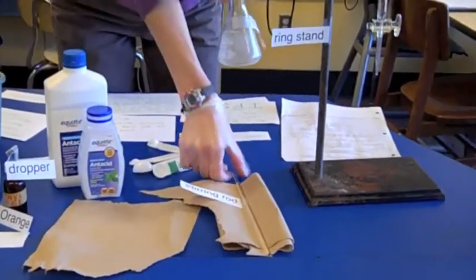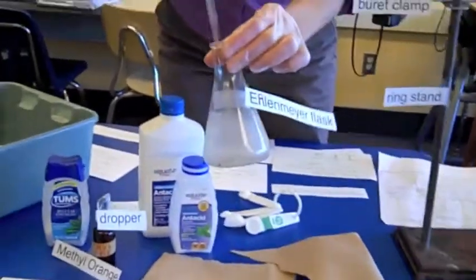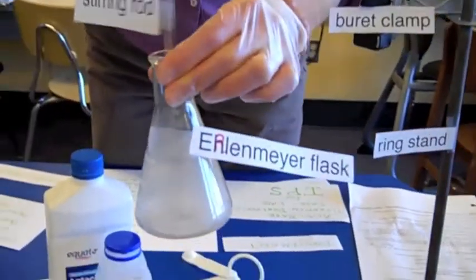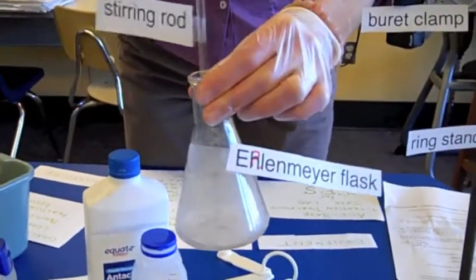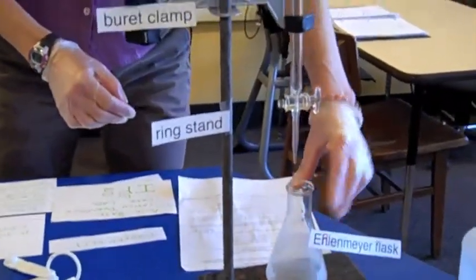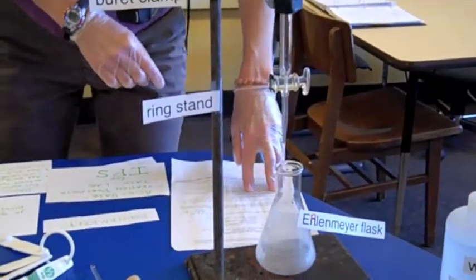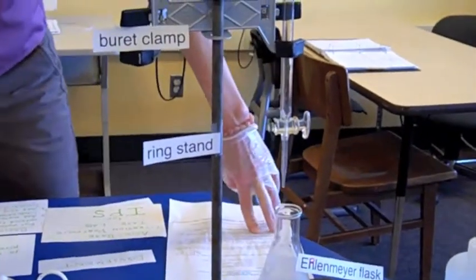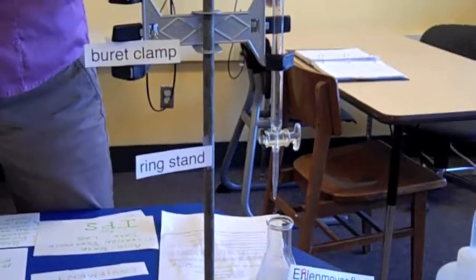Then you're going to stir it with the stirring rod until it's pretty dissolved. Stir it for 2 or 3 minutes. Then you're going to put it under your burette clamp. And the next step is to add the hydrochloric acid to the burette.